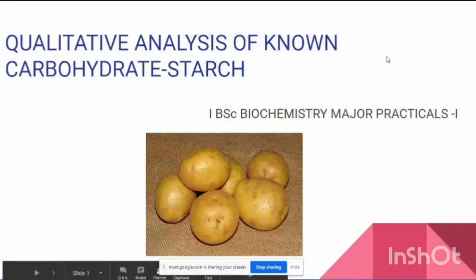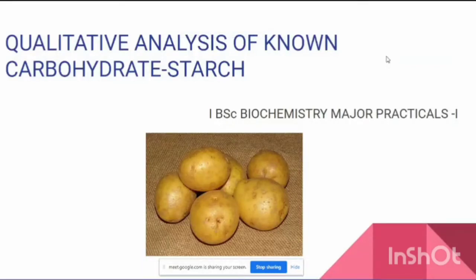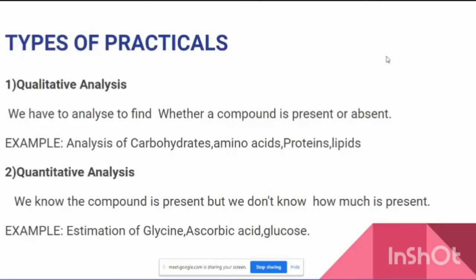In today's video, we're going to discuss the qualitative analysis of the known carbohydrate starch. So we know that starch is present in vegetables like potato, rice, and so on. So let us discuss starch today.